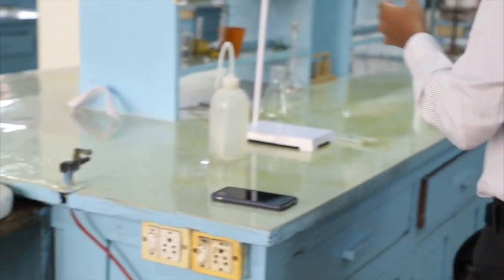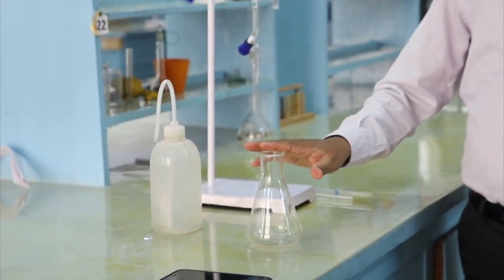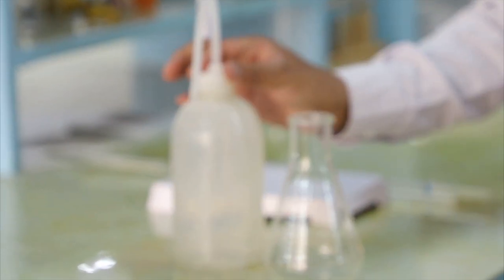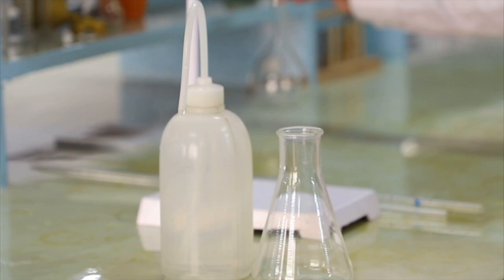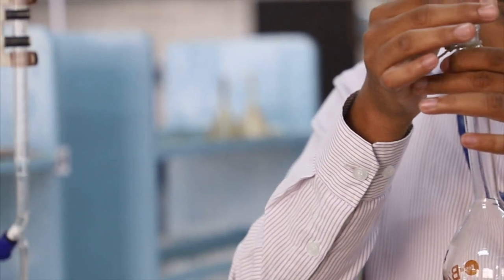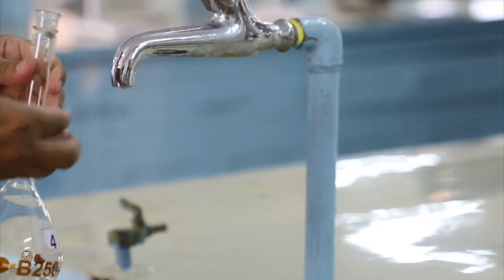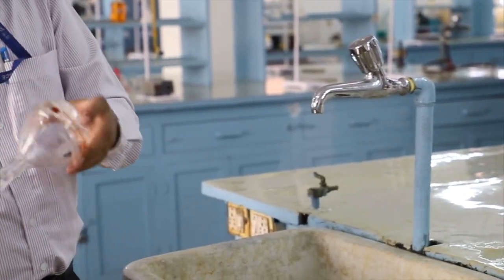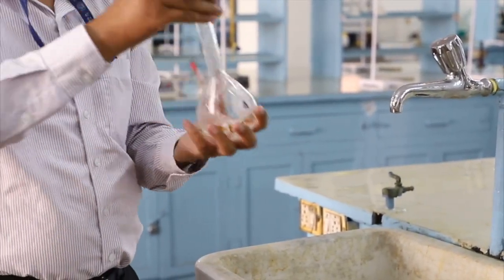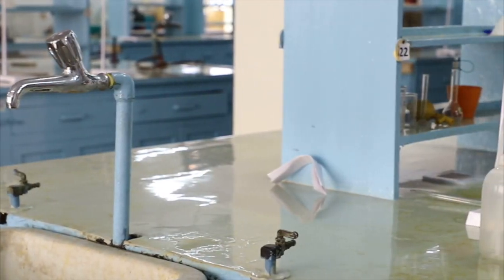Exactly the same thing should be done for the conical flask: it should be washed with tap water, then rinsed with distilled water. It's also true for the standard flask. The standard flask has a stopper here. You can close this lid. This is a stopper, so you can wash this with tap water. You can close this and properly wash. And then after that, it can be rinsed with distilled water.